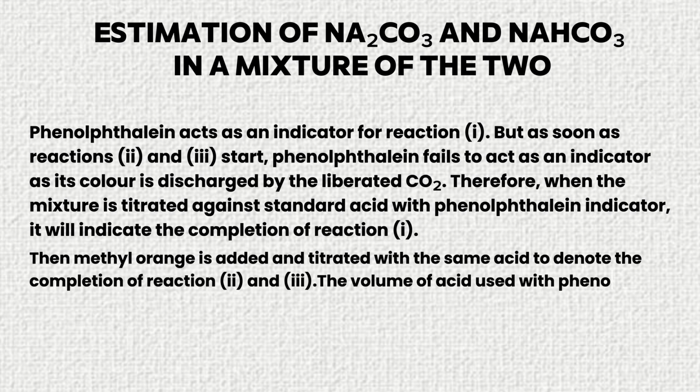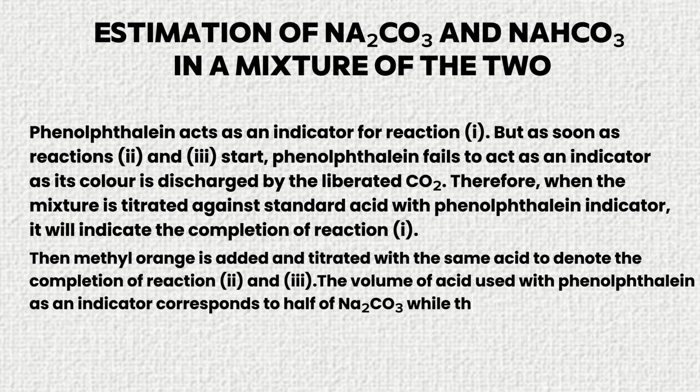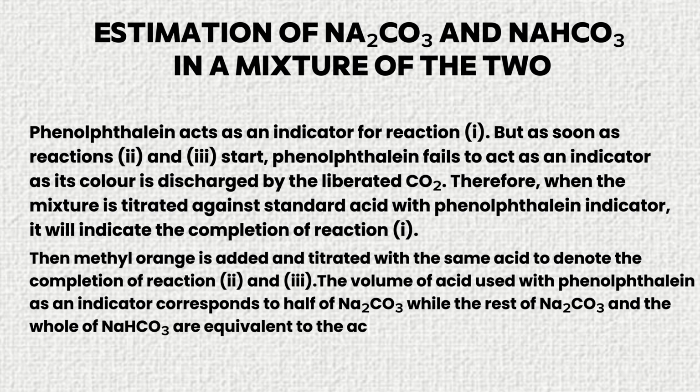The volume of acid used with phenolphthalein as an indicator corresponds to half of the sodium carbonate, while the rest of the sodium carbonate and the whole of the sodium bicarbonate are equivalent to the acid used with methyl orange as an indicator.